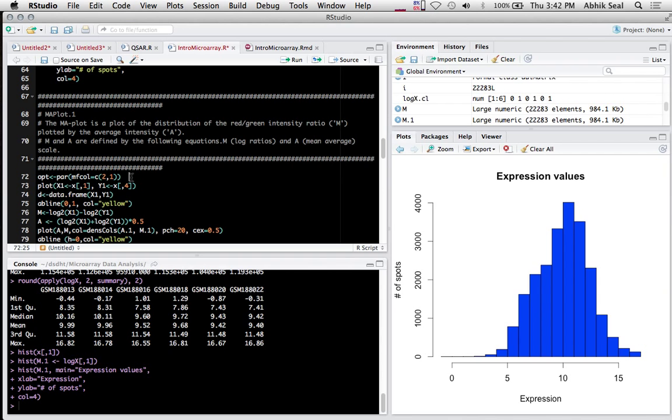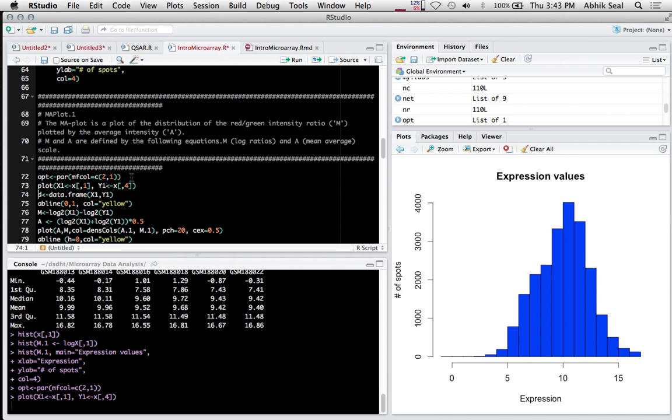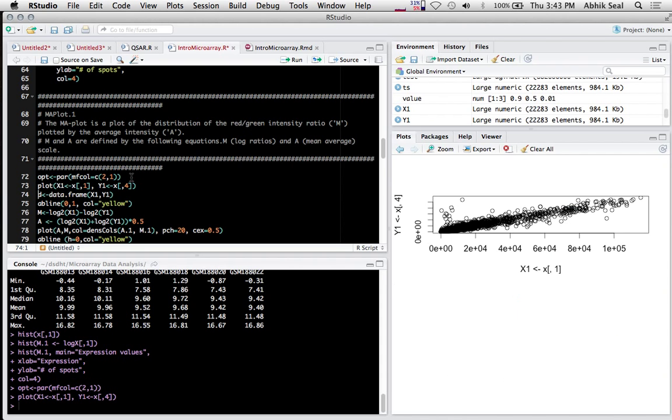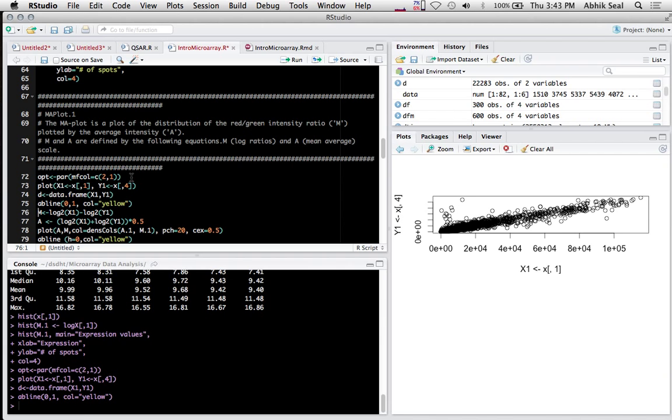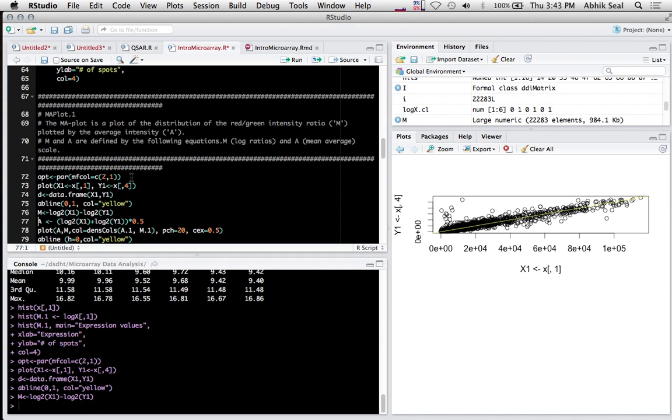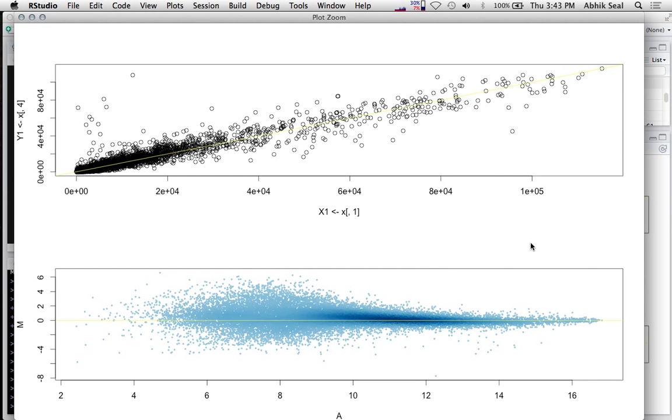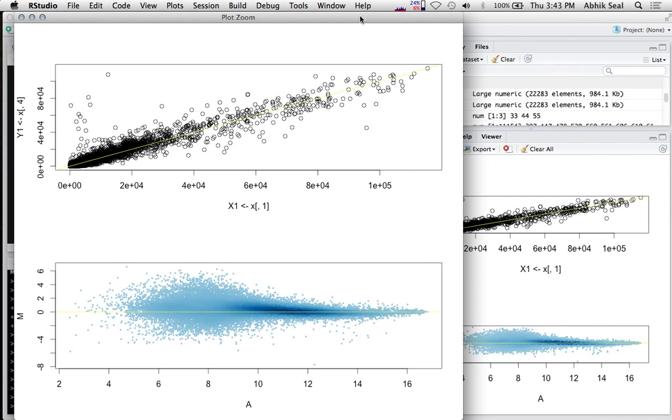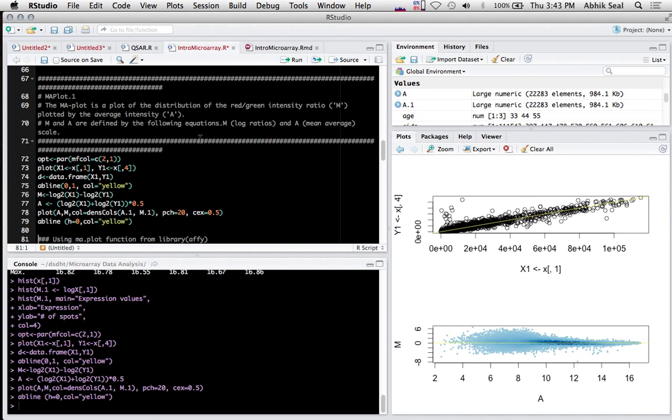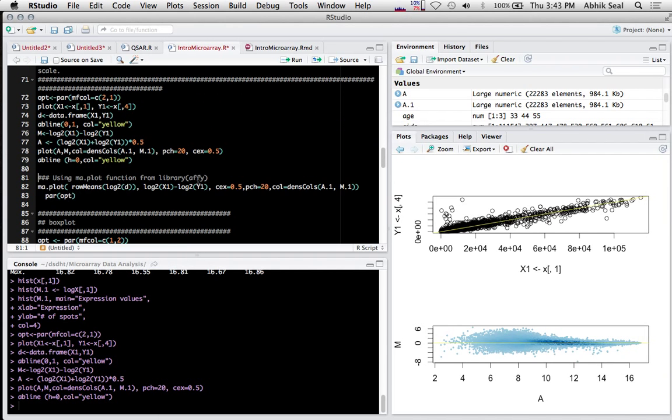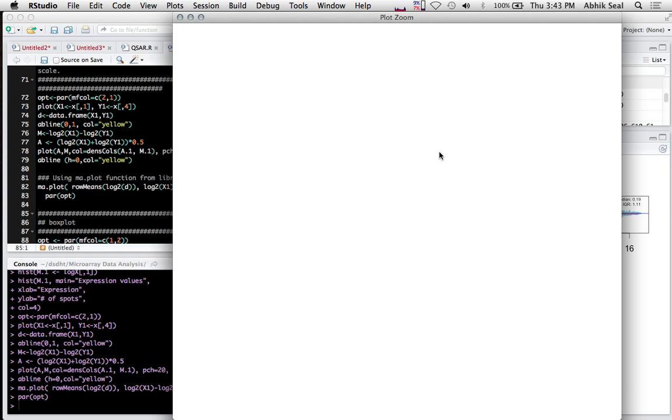M and A are defined by these equations - the log of the differences and the average. So I take one control set and one experimental set and plot the MA plot. There's also an MA plot function in the library API package.